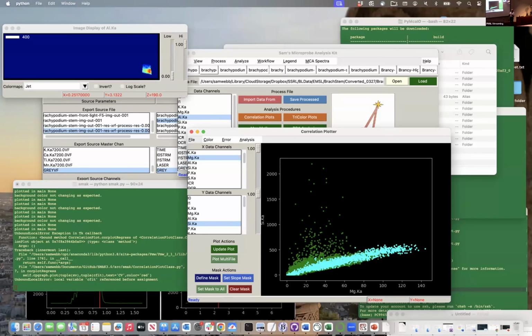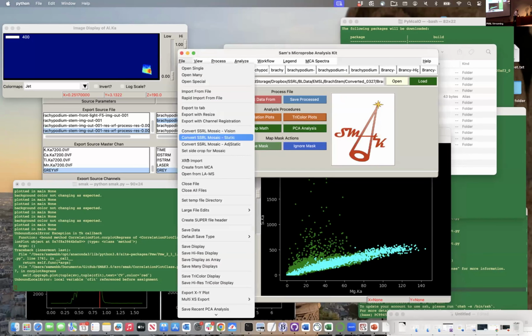If you also want the highest resolution, if you have a large map and the screen resolution is cramping your style and not high enough, if you do the save as high-res display, it'll save out into a TIFF file at full pixel resolution. So nothing is lost. It's great for big files, though everyone complains about the small files. It's like a postage stamp. Those people remember what mail is like. Postage stamp.